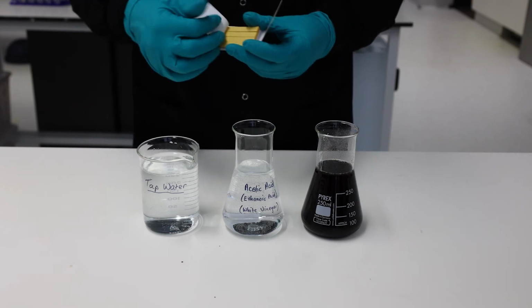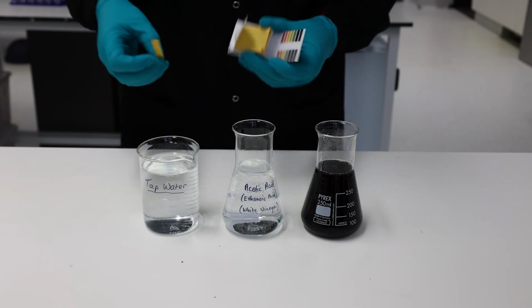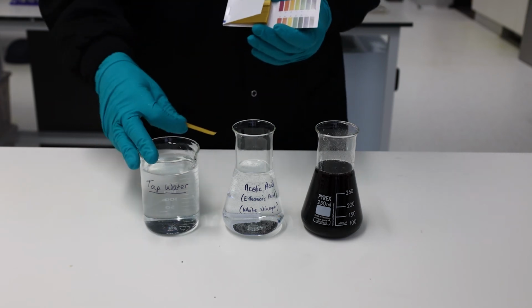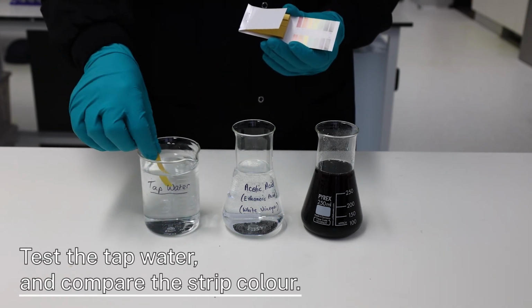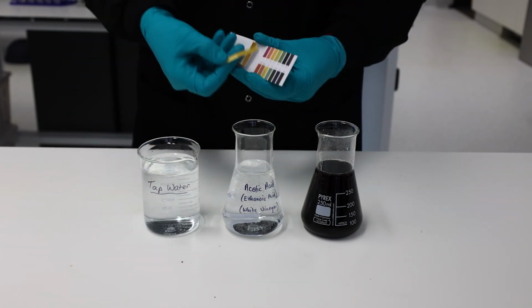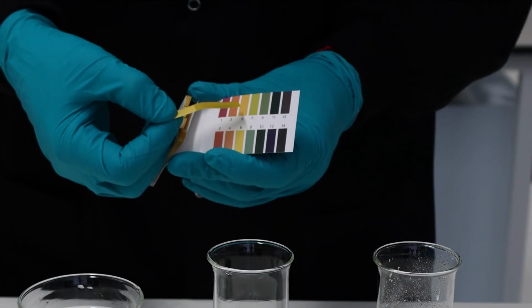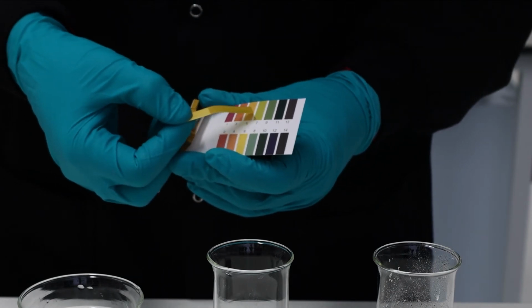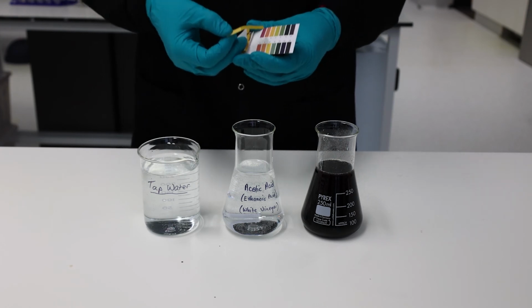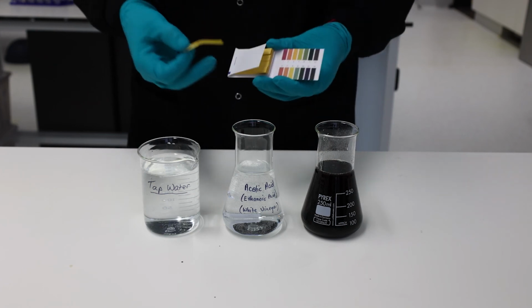It's very straightforward. You tear off a piece of the paper and you dip it in the solution, and then you compare the colour to the chart on the packet. So let's start with some tap water. So we dip the paper in, a couple of seconds, bring it out, and then we hold it up to the packet. And so here we see it's turning a slightly greeny shade of yellow, which is somewhere between 7 and 6. Now that's pretty normal for tap water, slightly acidic because the carbon dioxide from the atmosphere dissolves into it and forms a very, very weak acid.